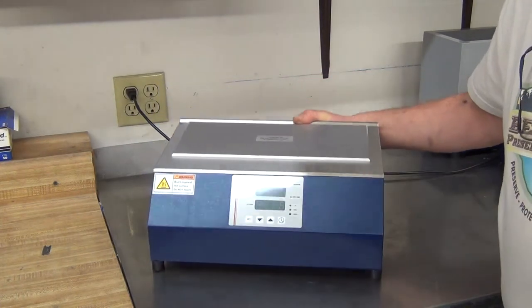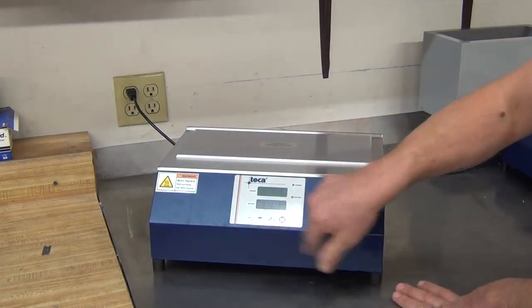There's no taps, there's no mars to the surface. Here you have your temperature controller for easily setting the temperature.